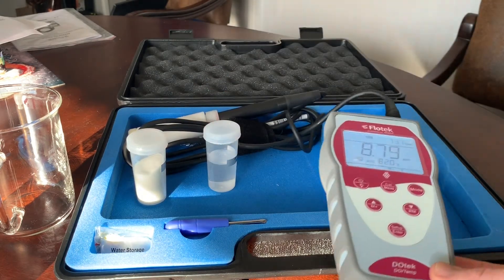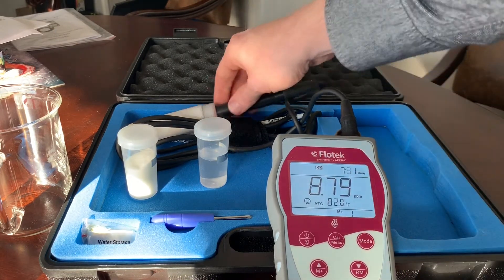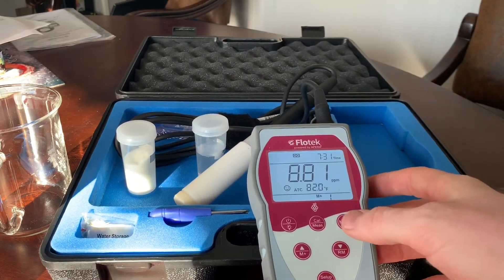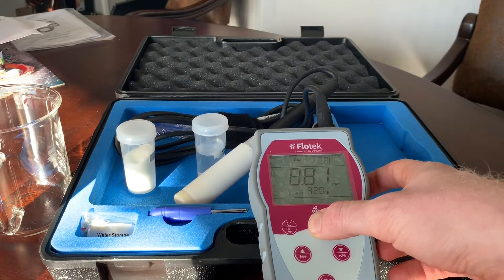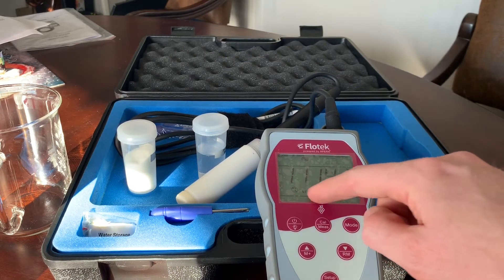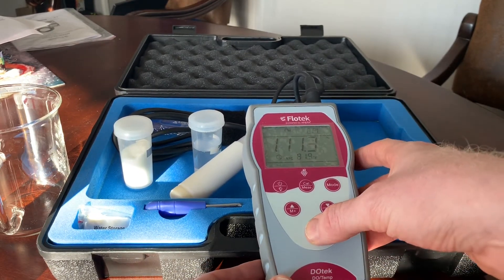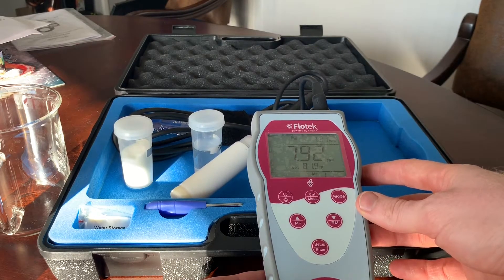In the meantime, we can do a measurement and calibrate at 100%. For this, we want the probe in the sleeve itself. Make sure the little sponge on the bottom is moist. To do the calibration, hold the calibration button to put ourselves in calibration mode. We check that our temperature is stable and nothing is changing too much. To accept that, we go ahead and hit setup, enter. This is our new 100% point.